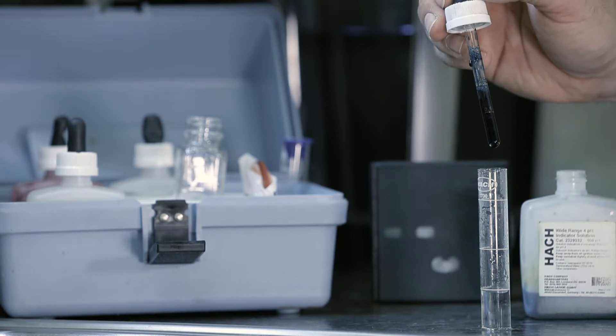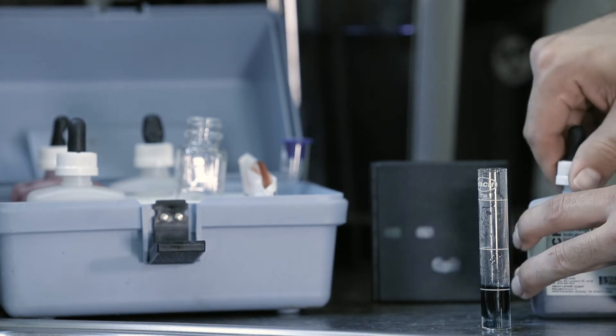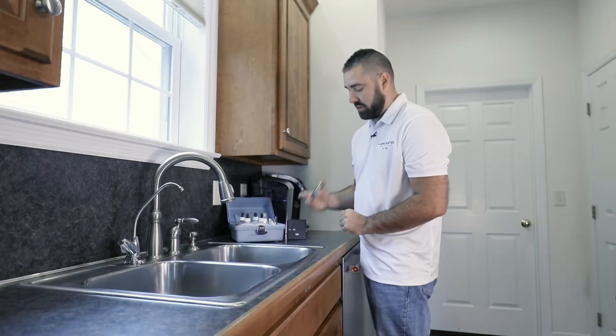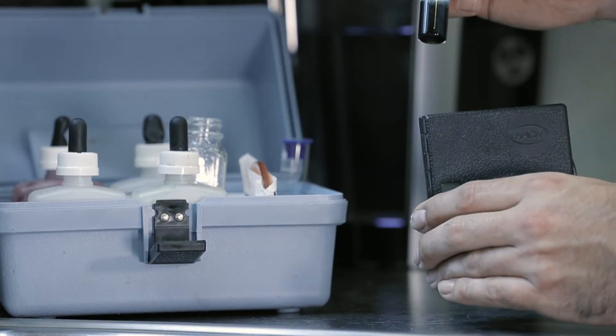Drop six drops into the vial. Once six are in, cover the tube and shake. The vial will turn a color ranging from yellow to blue.